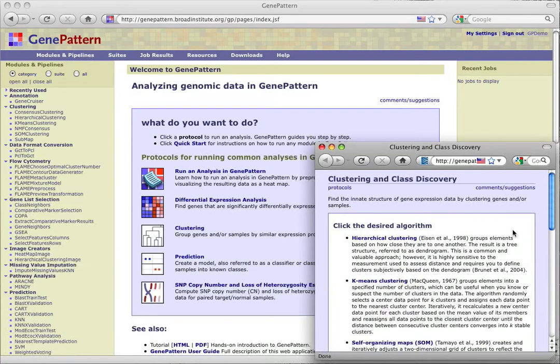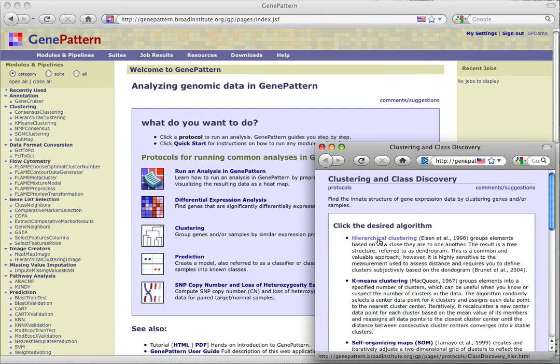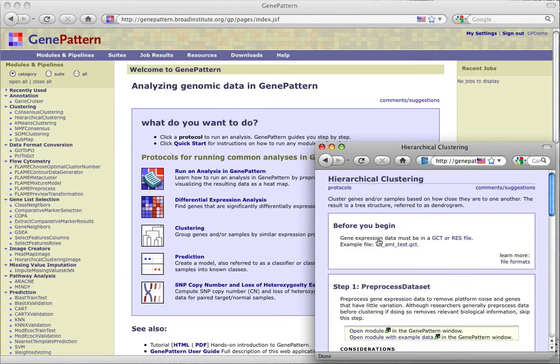For this tutorial, we'll choose hierarchical clustering. As there are no more decisions to make regarding the kind of analysis we're running, the step-by-step protocol is now displayed, starting off with a brief description of what the analysis does and what we'll get for results.